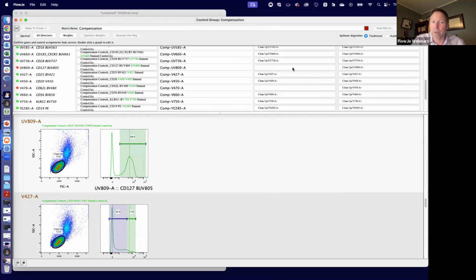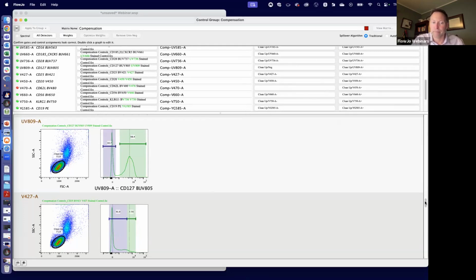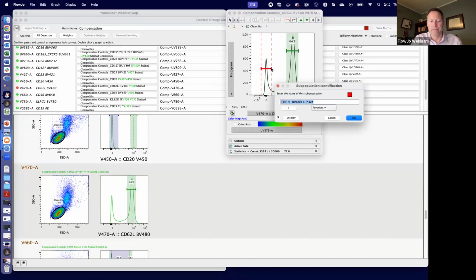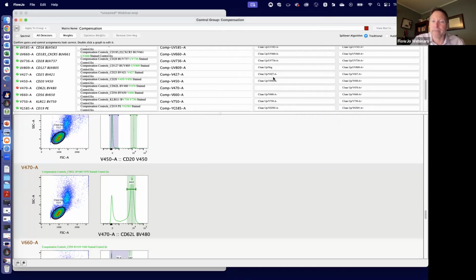It's like I've got 4 more to take a look at. It all looks like it's pretty much the same thing where we had a nice, beautiful peak that for whatever reason the algorithm didn't identify as a peak.